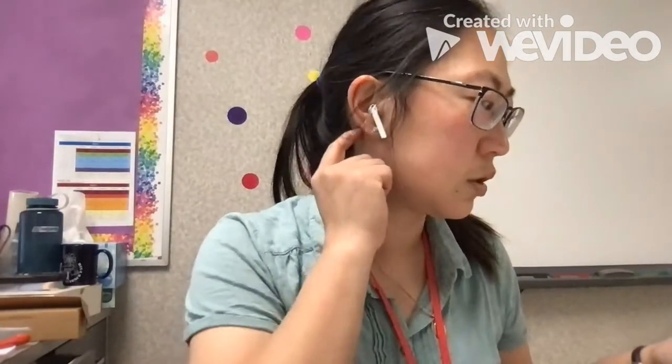So if I pour, I think you can see what direction the vapor is going in. Let me hold it up here.